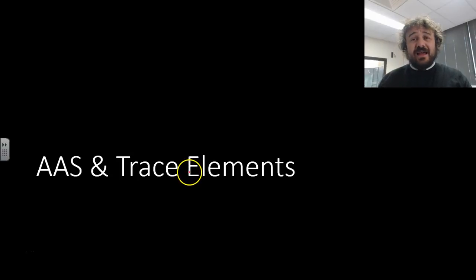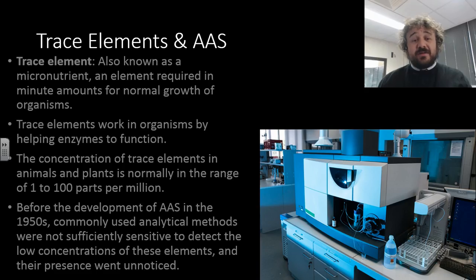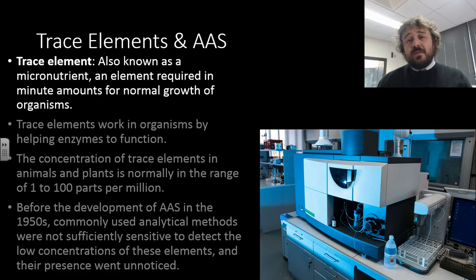So let's now have a look at AAS, or atomic absorption spectroscopy, and how it's been used to influence our understanding of the trace elements. So, what is a trace element? Basically, it's an element that's in the environment or an organism. This is particularly talking about an organism in really small quantities.